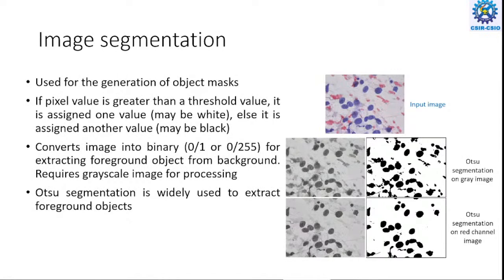So what is happening here is that, from the intensity value, we calculate a threshold: if a pixel is lower than that intensity value, we label it as 0, and if it is above that, we label it as 1. So that is a binary image in the range of 0 and 1, or we can also say in the range of 0 or 255. If you see, all the cells were dark, so those are shown in black color, and the background is shown in white color.